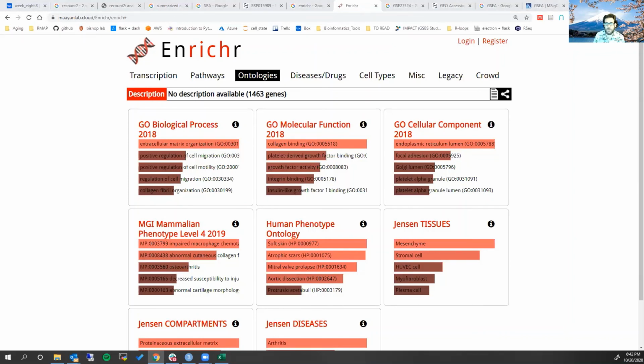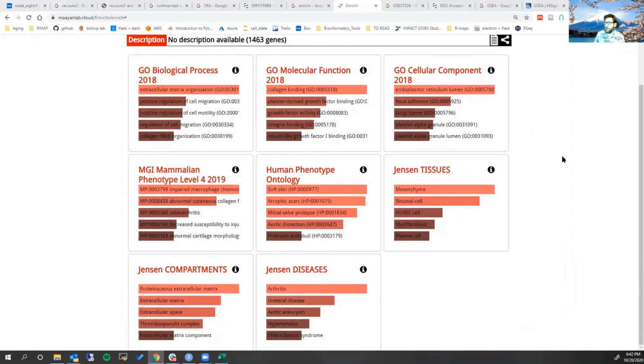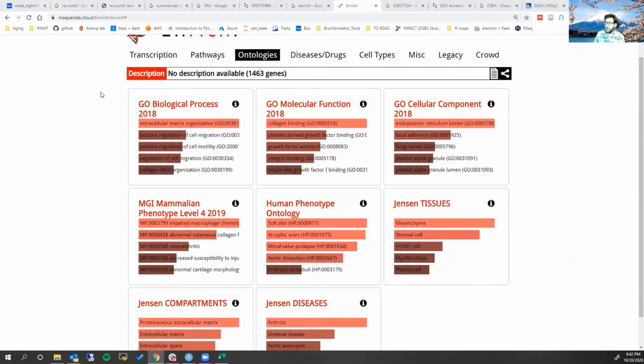That was a yes. Okay. Yeah, that's one of the things I really like about it as well. Now, I think that what they're doing here is actually totally achievable with gene set enrichment analysis, but for some reason, no one's done it yet. So for right now, I think they're the only ones where you get this really nice side-by-side, database by database look at it.